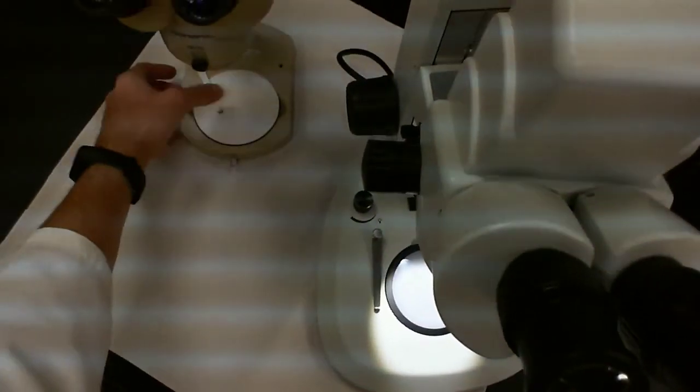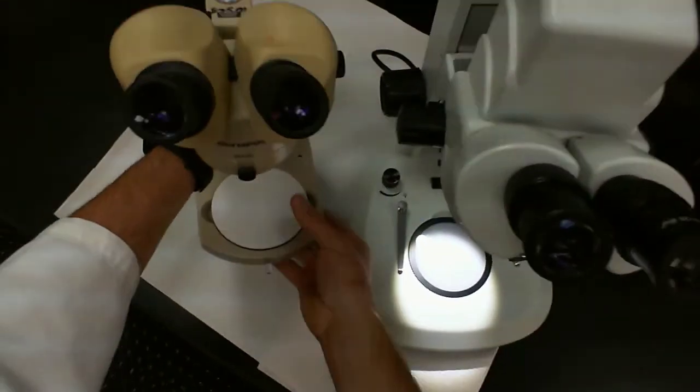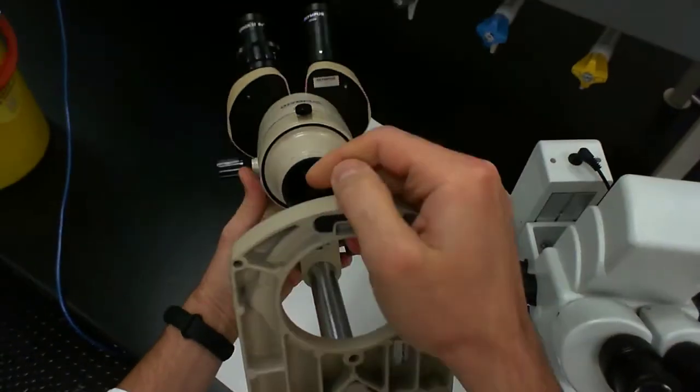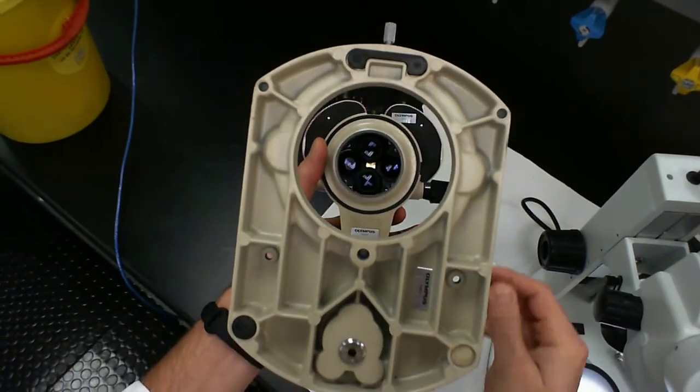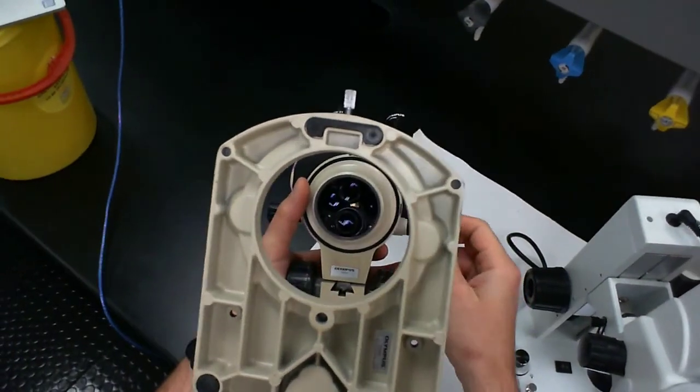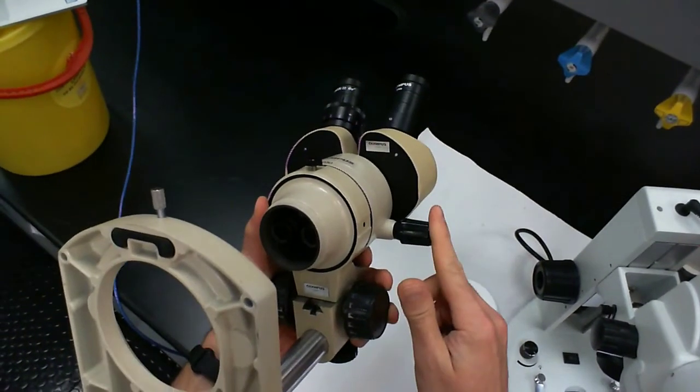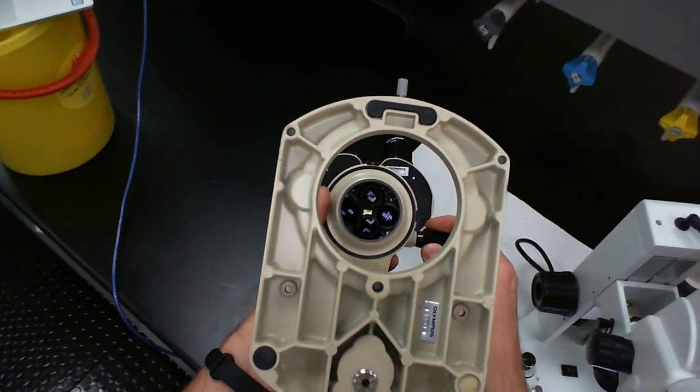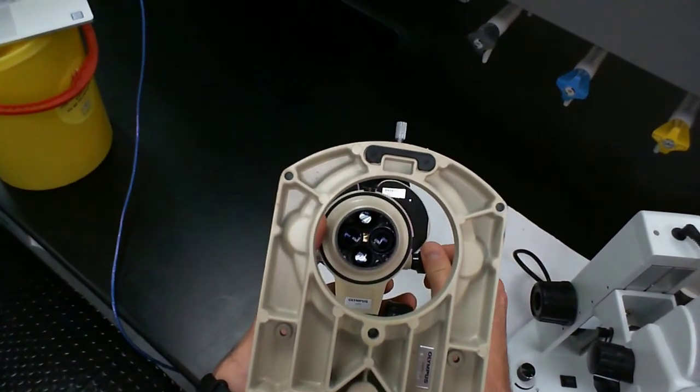This old microscope can actually show you that there are in fact more than just one lens. I'm going to pop out this stage and look at this from underneath. We can see here we in fact have two sets of lenses. When I use this adjustment knob, you can see that these lenses change, they rotate. You actually have two different magnifications that are available to you on this older scope.